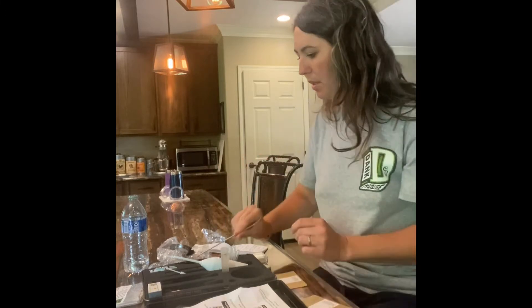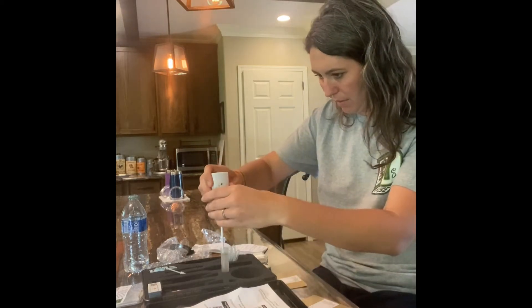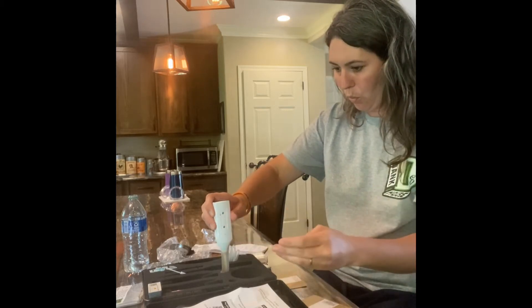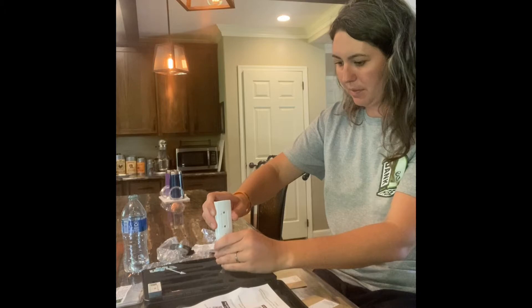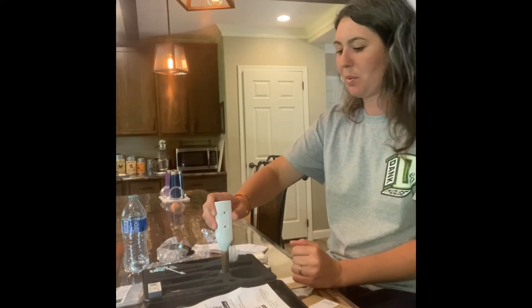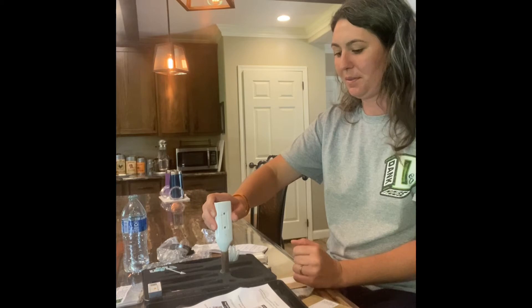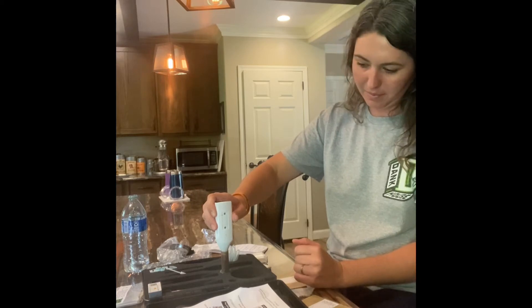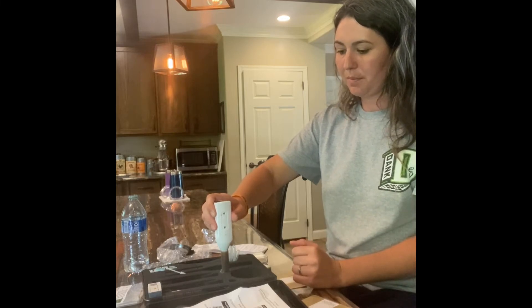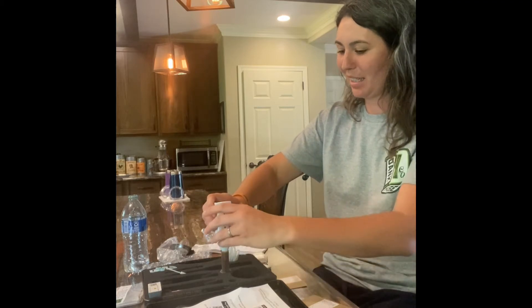Now we'll use this little whisk he sent us. It's kind of dripping out — put a little too much water in there. We're going to mix for 30 seconds — just imagine when it's been 30 seconds. I think it's been 30 seconds, let's go.